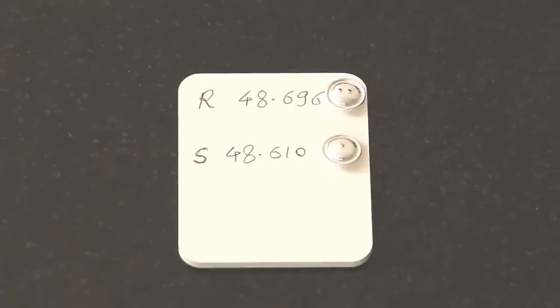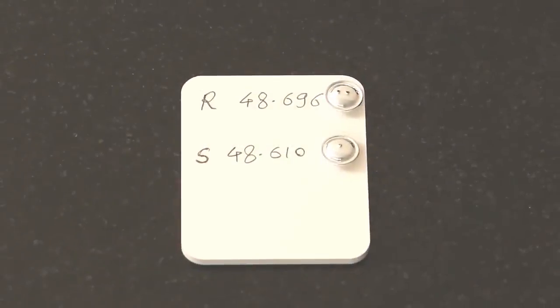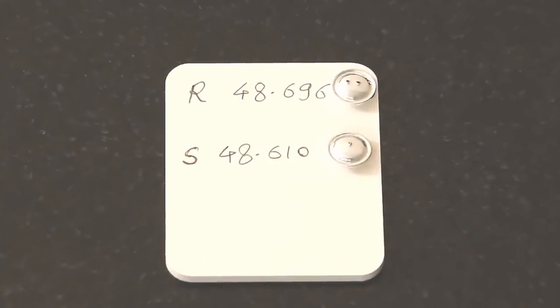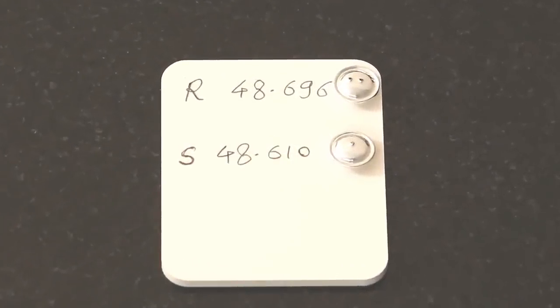DSC measurements are carried out with a reference and a sample crucible, each with a lid. In order to achieve good measurement results, the crucible and lid combinations weight on the sample and the reference side should not differ more than 0.2 milligrams.